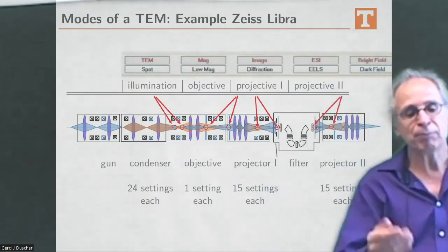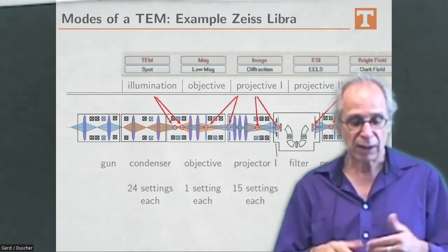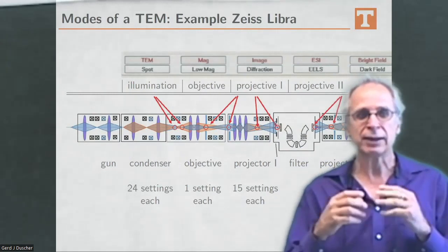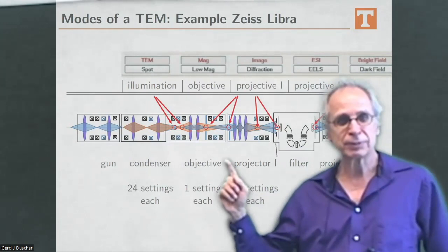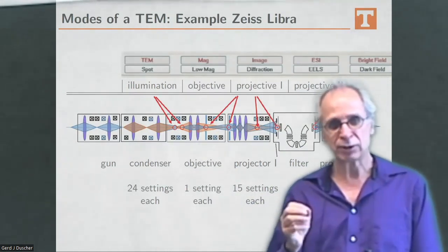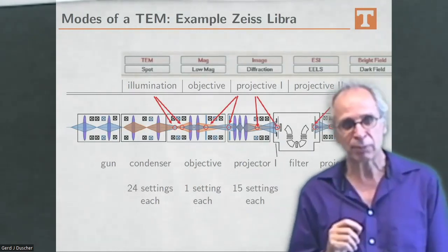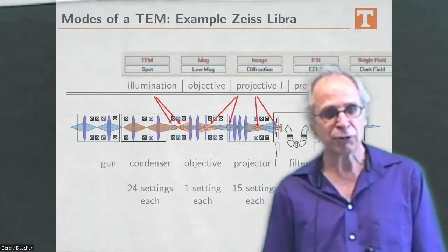If you bend the beam, the fast electrons get bent less than the slower ones. And so you have sorted out your electrons by energy. We have other sorting mechanisms. In the diffraction plane, we have sorted out the electrons by angle or momentum. And in image plane, we have them sorted out by the spatial position. So we have different sorting algorithms.